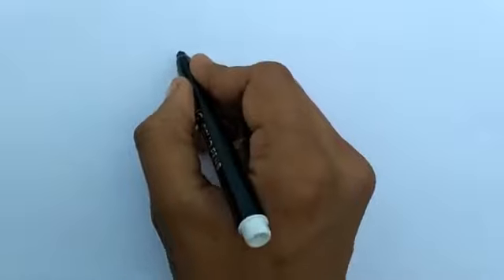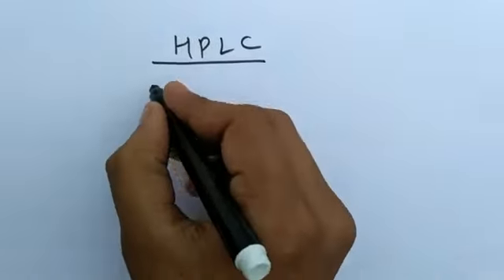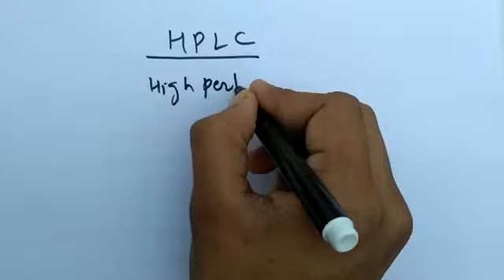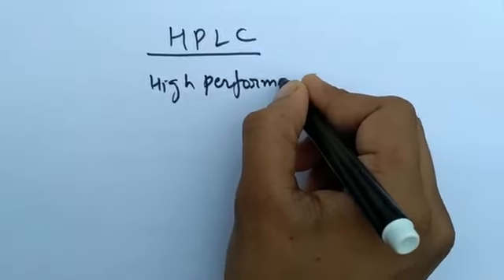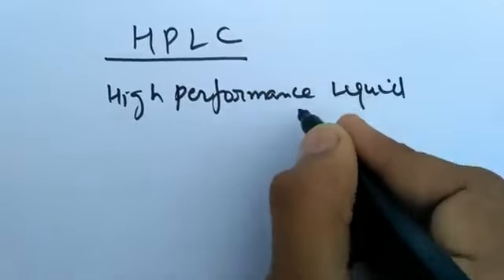To all of you. Today in this video discussion, I will discuss HPLC. It means high performance liquid chromatography.